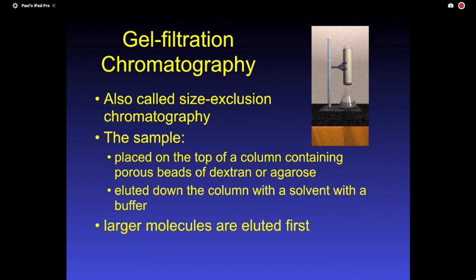If by chance you had a protein that is long in one dimension and short in another, then as it tumbles, it will take up the radius of the longest end. It can actually look deceptively large because it takes up a large volume as it tumbles. But in general, it's usually smaller size to larger size because most proteins are globular. You can have some oddball things happen if the protein isn't truly globular.